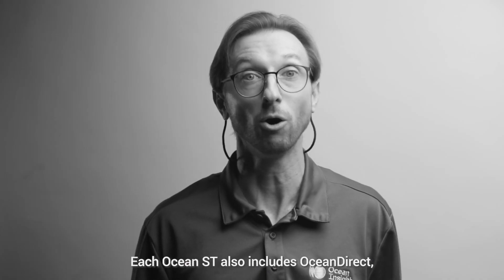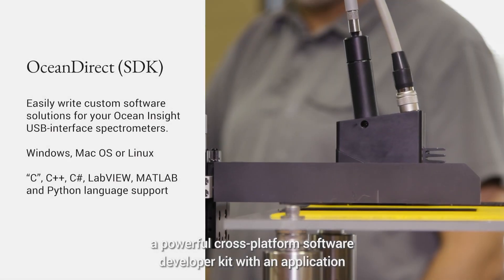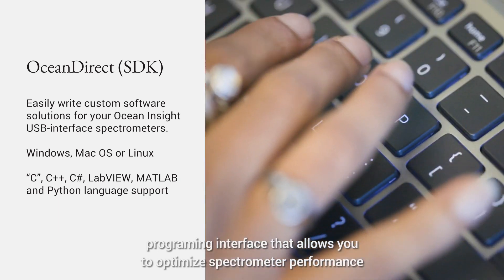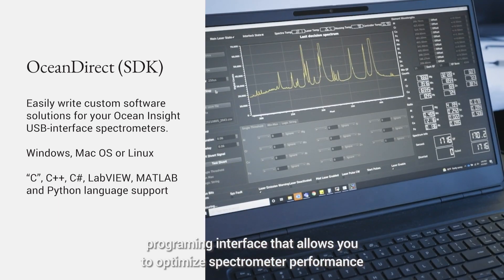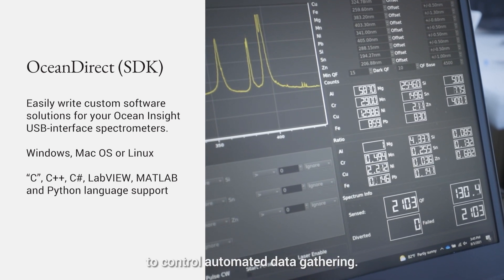Each OceanST also includes OceanDirect, a powerful cross-platform software developer kit with an application programming interface that allows you to optimize spectrometer performance and easily write custom software solutions to control automated data gathering.